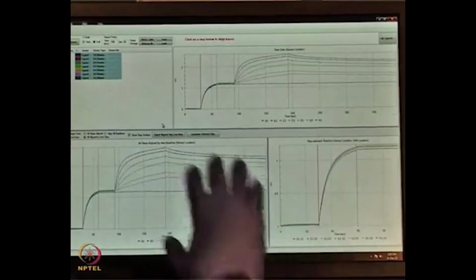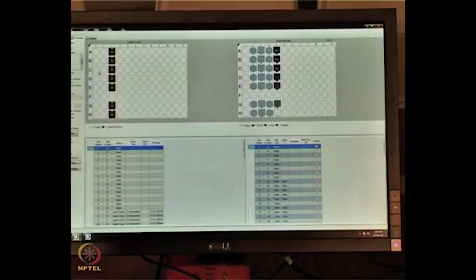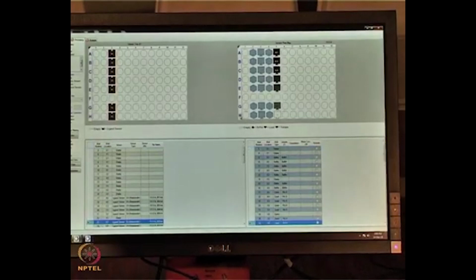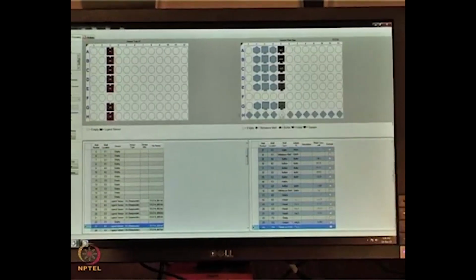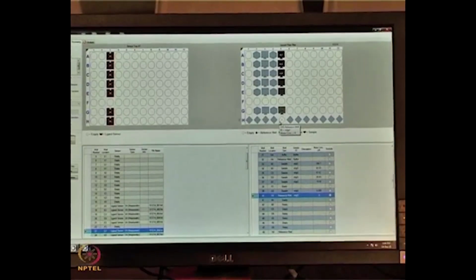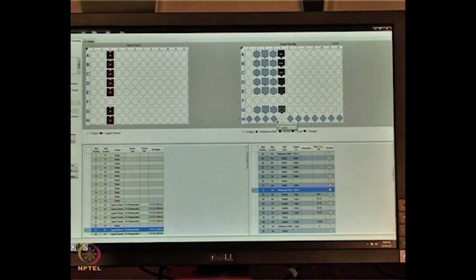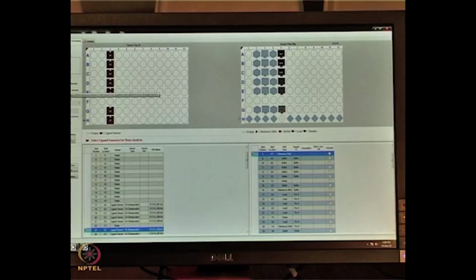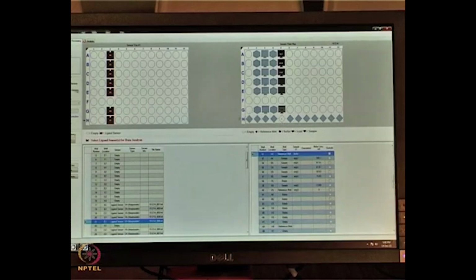In the processing tab, we will see the raw data. What we are doing is subtracting. In one of the columns I had put a 0 concentration. This column I will change to the reference well. This is the 0 concentration, because some of the artifacts from the buffer we can subtract from the data. That is why I am going for the reference subtraction. On the left hand side, here we have the subtraction icon. We have different types of subtraction systems. Here I am using just the 0 concentration for the subtraction.